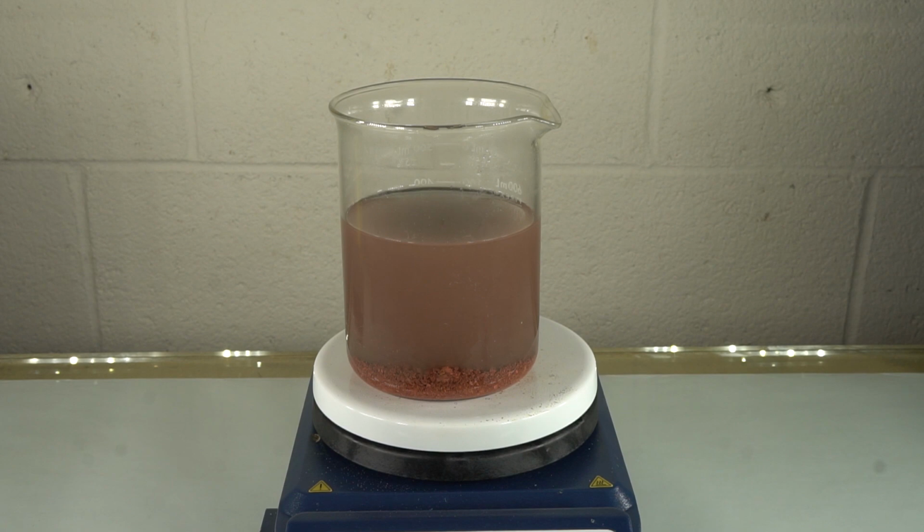So the reaction is complete. That last piece of aluminum foil only had a little bit of copper on it, and all I did was shake it around a little bit with this glass stirring rod, and the copper metal shook off the aluminum foil, and then it was very easy to drag that piece of foil out.